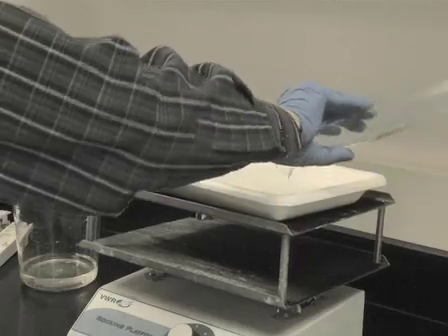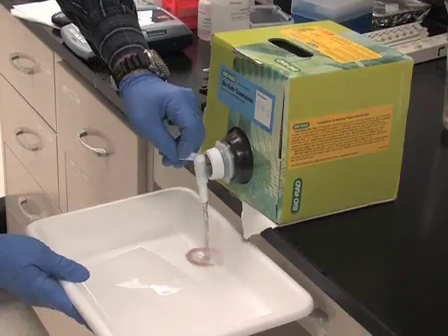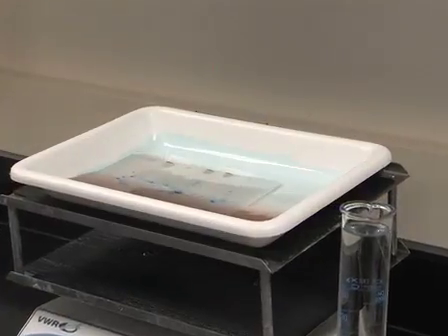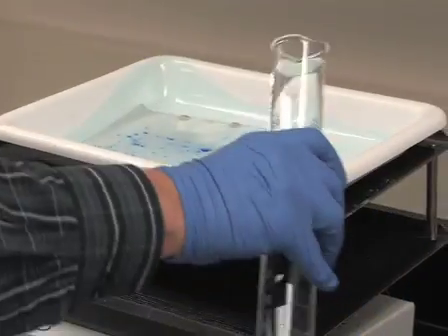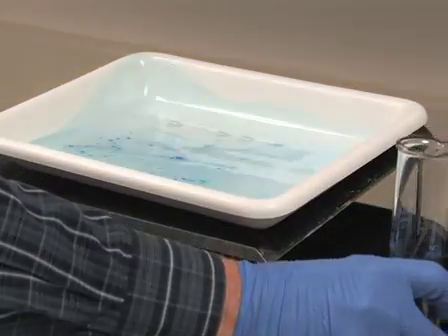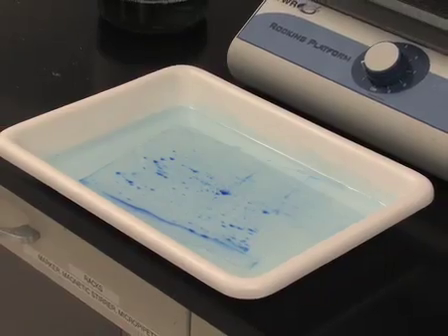After the third wash, pour out the water and cover the gel with Coomassie Blue staining solution for 1 hour while agitating slowly. After 1 hour of staining, pour out the staining solution and rinse the gel briefly by placing in about 200 milliliters of water for 30 minutes. At this point, the gel may be stored in water for future imaging.